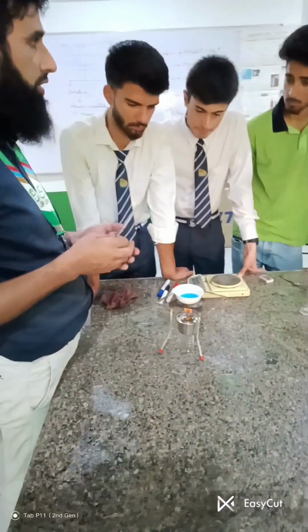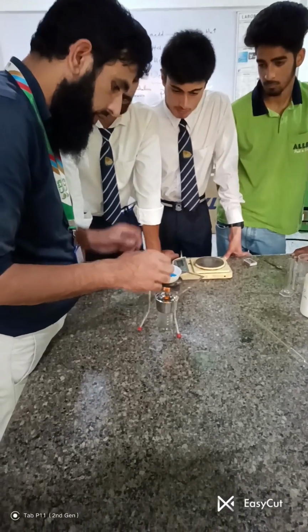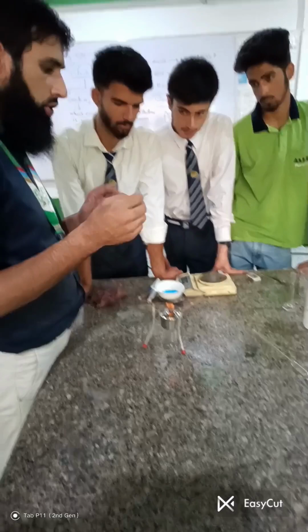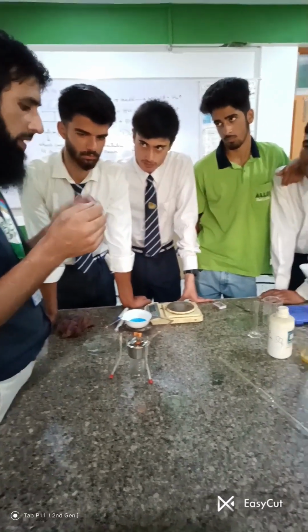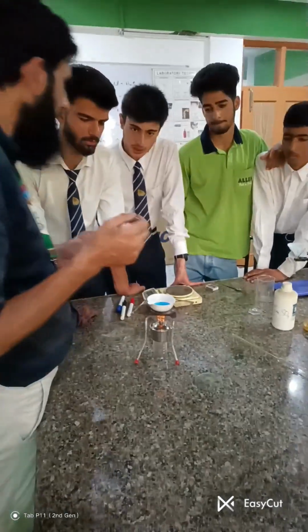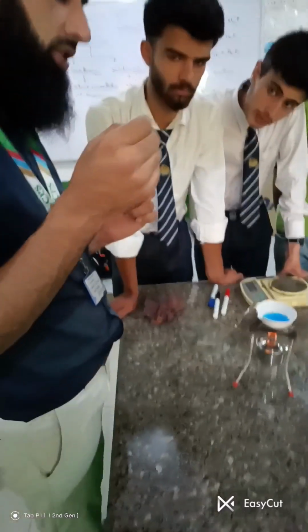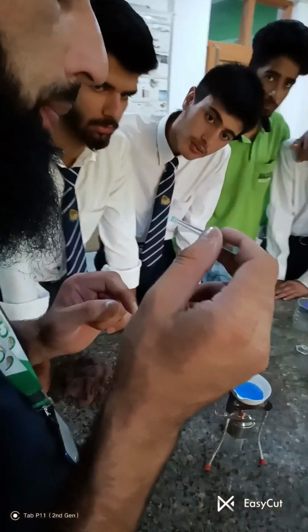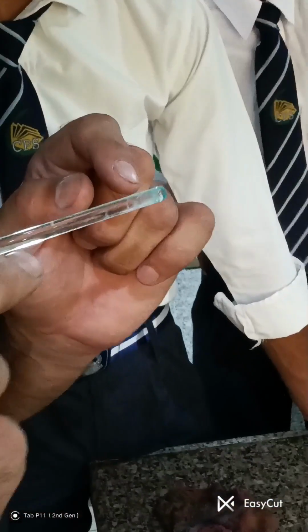I was telling you how you can determine whether the crystallization point has taken place or not. You simply stir the solution. After stirring, you blow air on the stirring rod like this. If crystals appear on the stirring rod, then the crystallization point has been reached. We will blow. You will see clearly the crystals appear on the stirring rod. You can check, the crystals have appeared on the stirring rod.